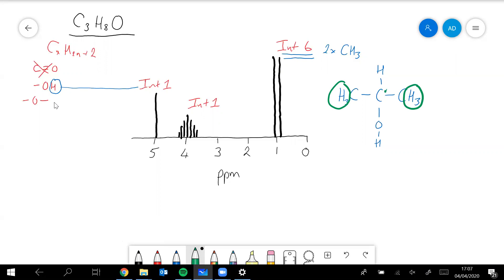So n plus one rule, that means that these green hydrogens should give you a doublet, and that's what we've got here. We have got a doublet there, so that's almost certainly what is causing that peak there.